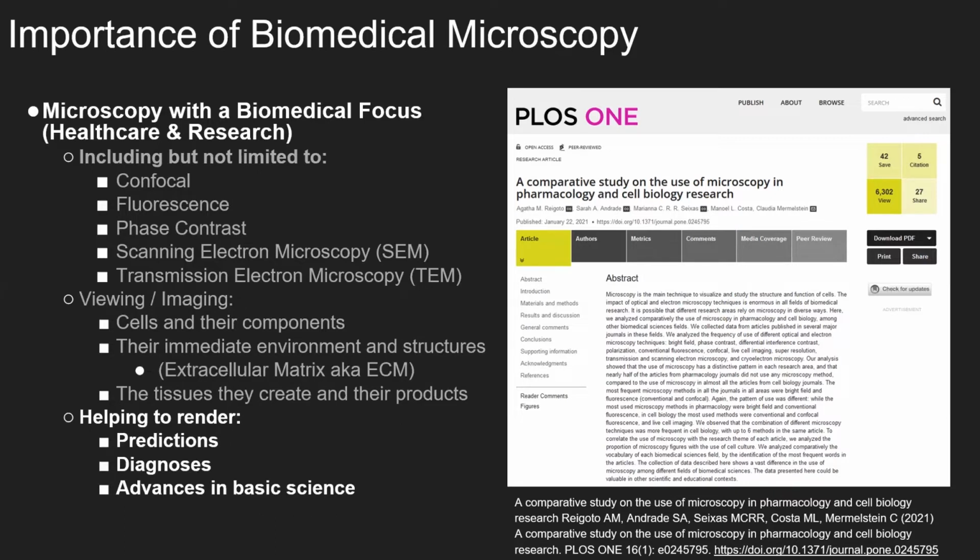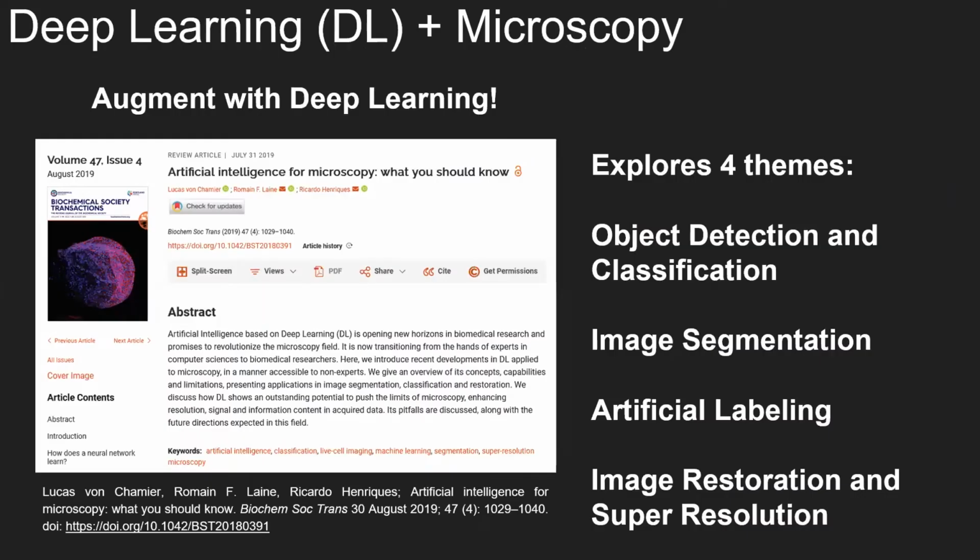Now, the use of microscopy in the biomedical sense allows us to make predictions, to render diagnoses, and also advance in basic science and engineering. So, I love microscopy, very fun. I will say that it can be very time consuming, but a way in which we can augment a lot of our workflows is with deep learning.